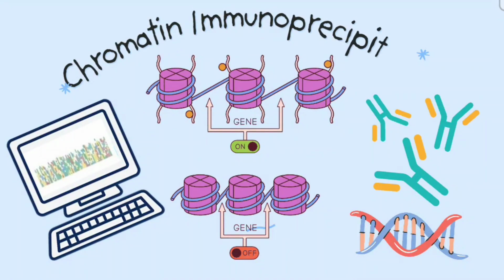Have you ever wondered how scientists figure out which proteins are binding to DNA inside our cell? Let's dive into the world of ChIP, chromatin immunoprecipitation, with me on my YouTube channel Bioscope.